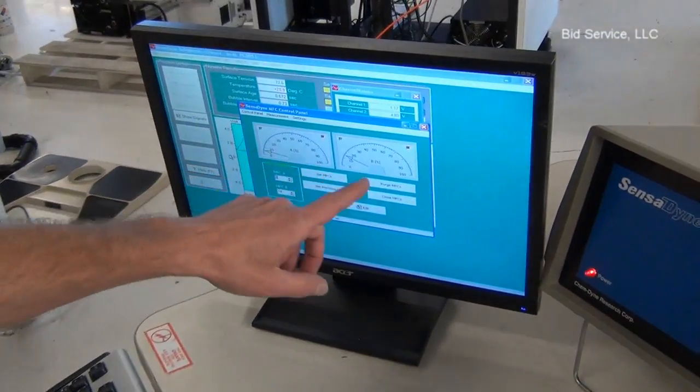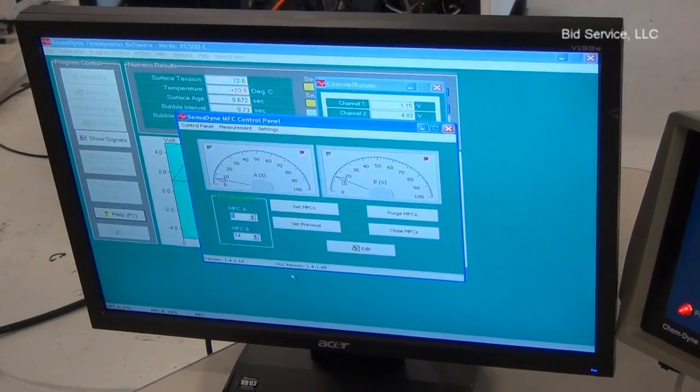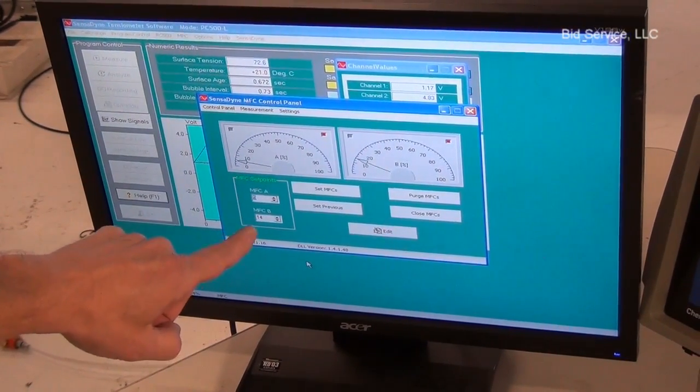Over here is your mass flow controller control panel. You can see I have the smaller one — MFC A is set for 5 and MFC B is set for 14.